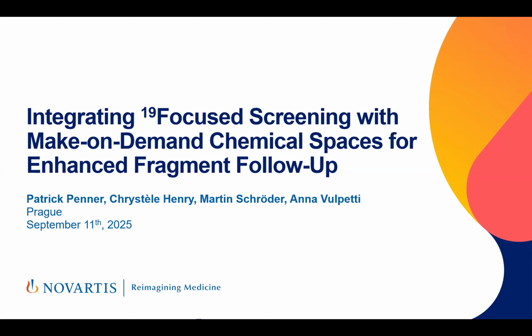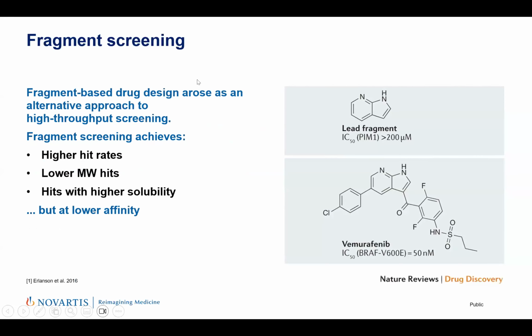So today I want to talk to you about integrating 19F NMR focus screening with make-on-demand chemical spaces for enhanced fragment follow-up. And if I can switch the slides, there we go. So 19F NMR screening has been a core part of fragment-based drug design in Novartis for quite a while now.